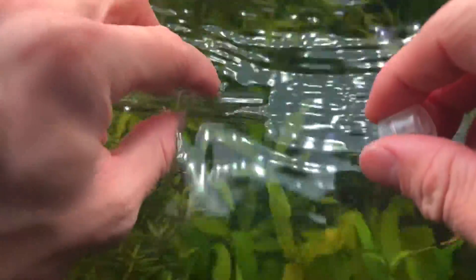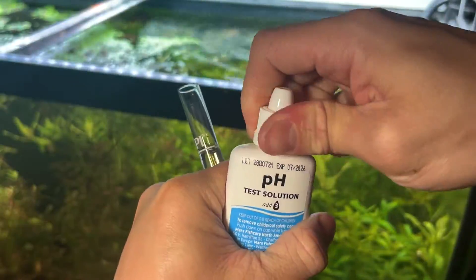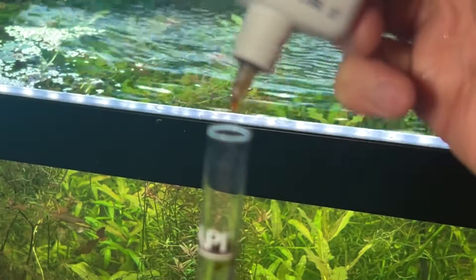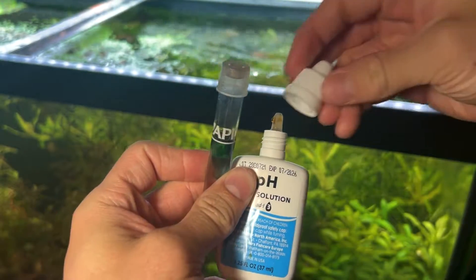First, I'm going to fill up the test tube to the desired line. Now that we have our test tube filled, let's add our pH liquid. The bottle says to add three drops of solution, so I'm going to add exactly three drops. Now I'll put the cap on the test tube and the cap on the solution, and give the mixture a good mix.